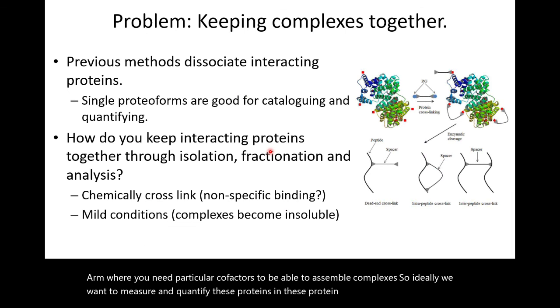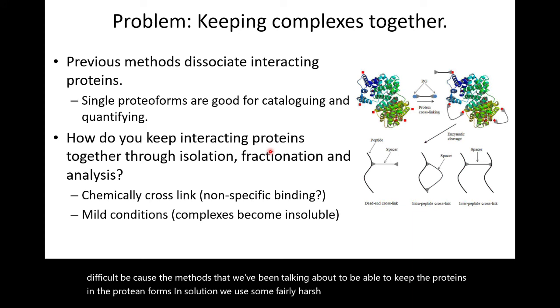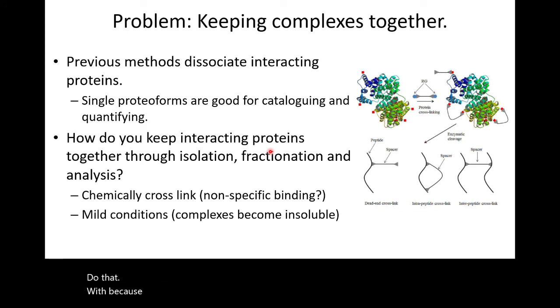This is actually really, really difficult because, to keep the proteins and the proteoforms in solution, the methods that we've been talking about use some fairly harsh conditions. And so we can't do that, because we'll disrupt the interaction between these different proteins. So there's two main ways that people get around this.